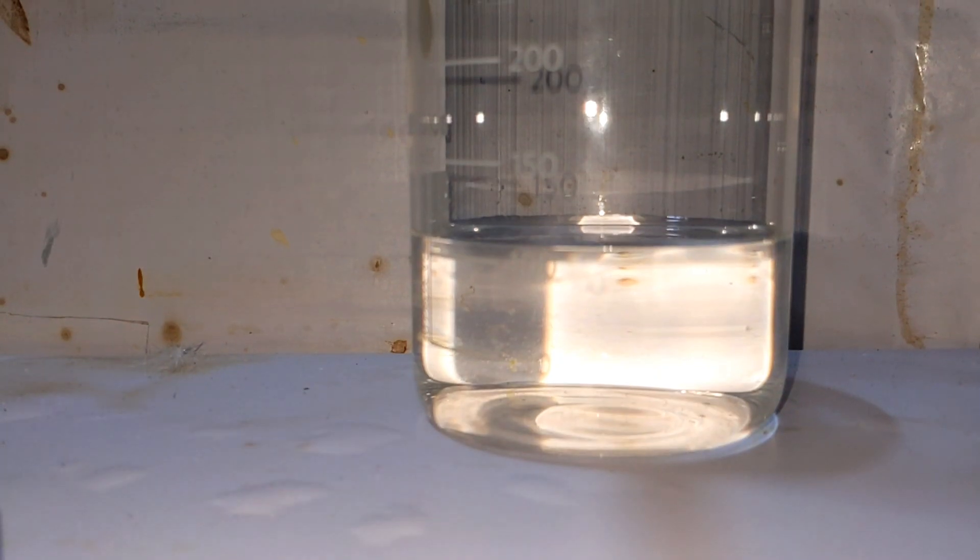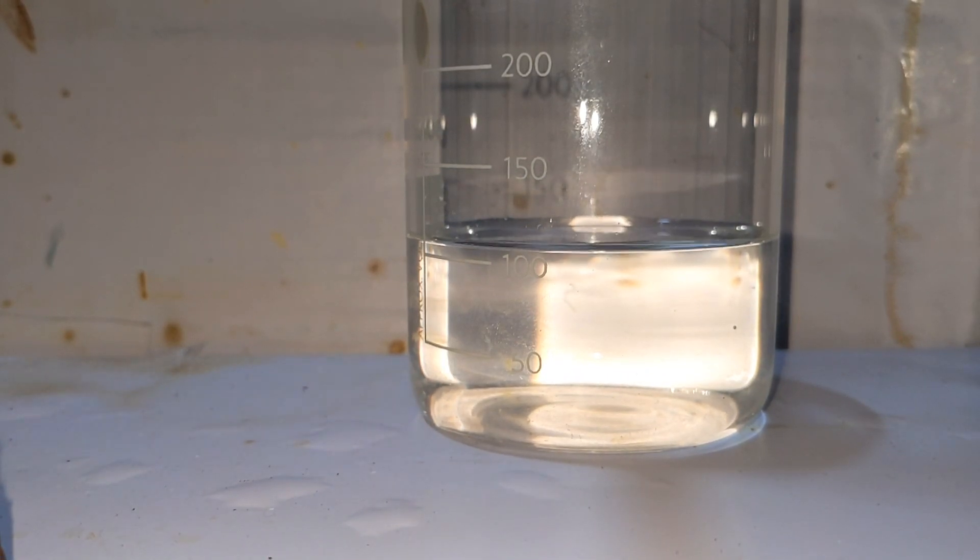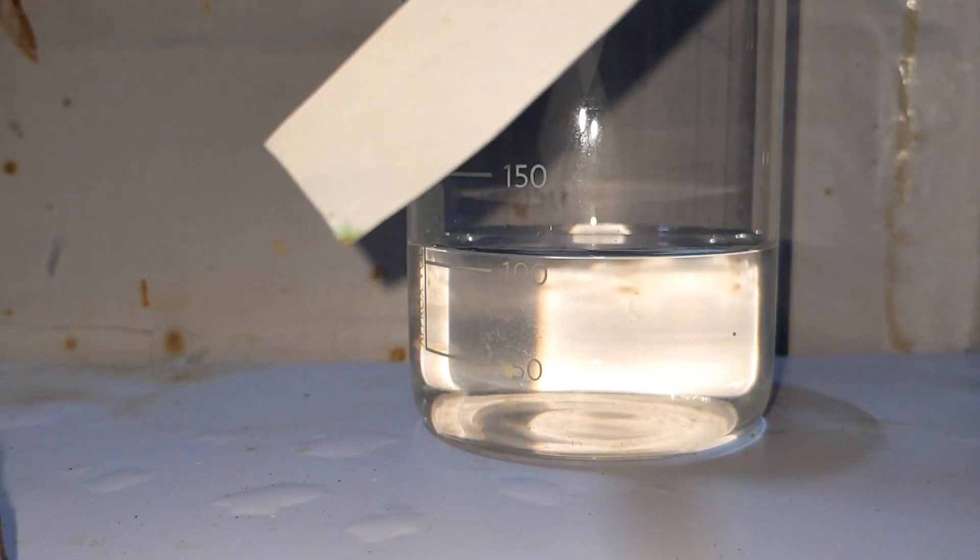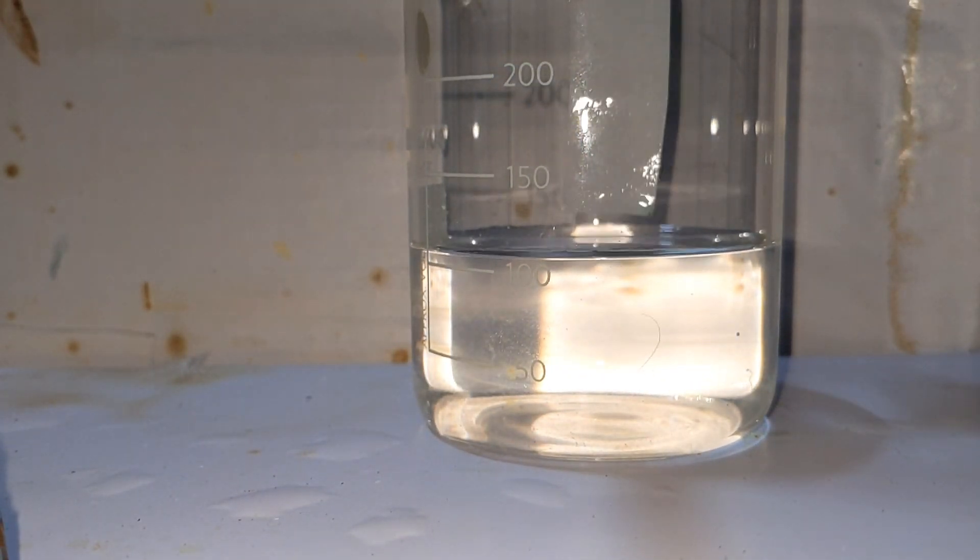Now we will do a simple test using lead acetate. Here I have a solution of lead acetate. Into that I will dip a filter paper and I will soak the filter paper in lead acetate and then I will dry this filter paper.